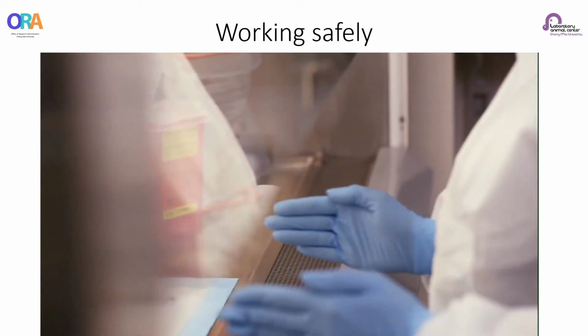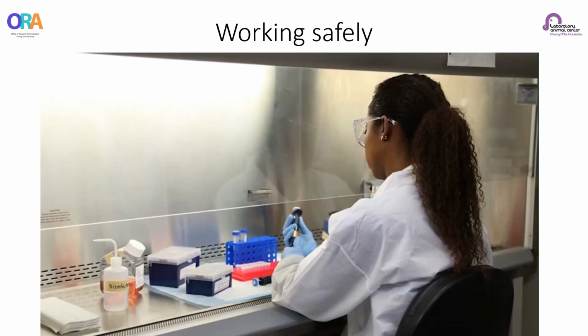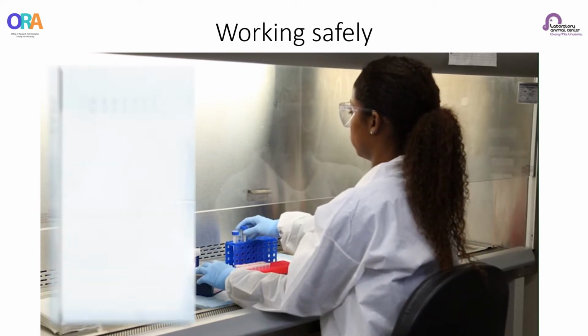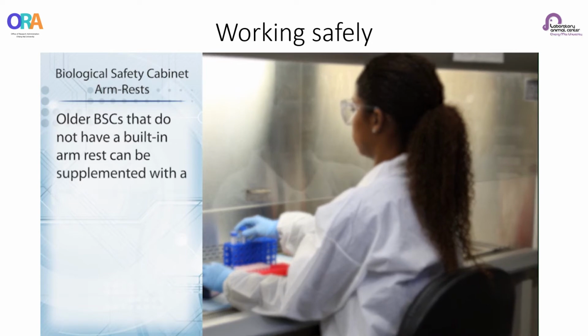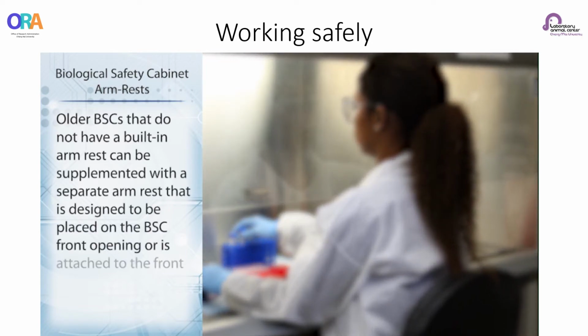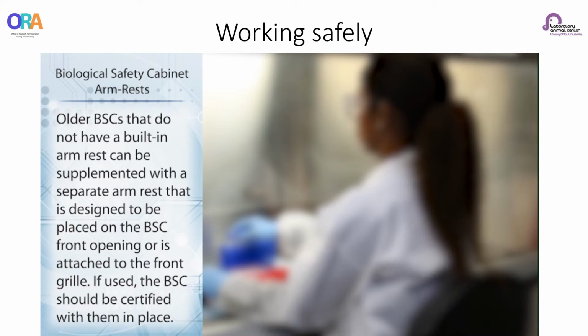Some BSCs are designed to allow your arms to rest on the front part of the BSC to avoid fatigue or ergonomic injuries over time. Older BSCs that do not have a built-in armrest can be supplemented with a separate armrest that is designed to be placed on the BSC front opening or is attached to the front grille. If used, the BSC should be certified with them in place.